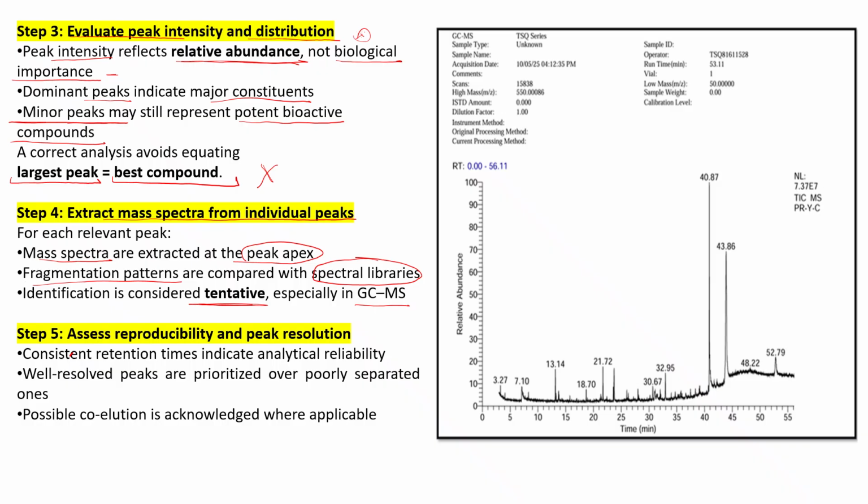Assess reproducibility and peak resolution. Consistent retention times indicate analytical reliability. Well-resolved peaks are given priority over poorly separated ones, and possible co-elution is acknowledged wherever applicable.